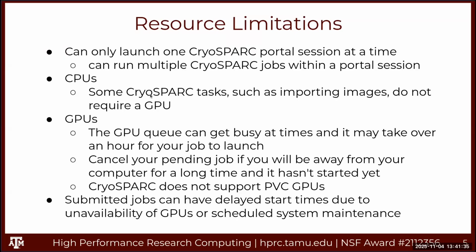If you need to import images, you can start a CryoSPARC session with CPUs only. The GPUs are in high demand. Sometimes it can take an hour or more for your session to start. But if you want to import images, you can just start with a CPU node.